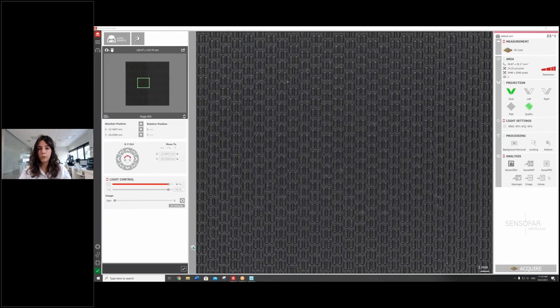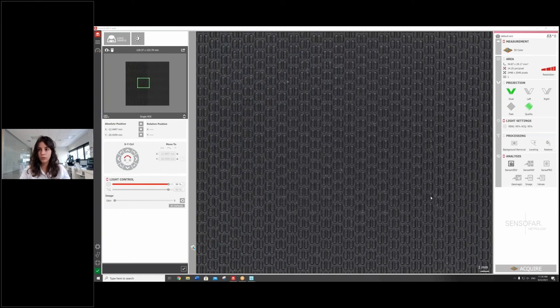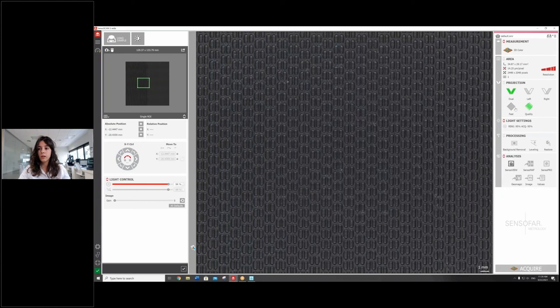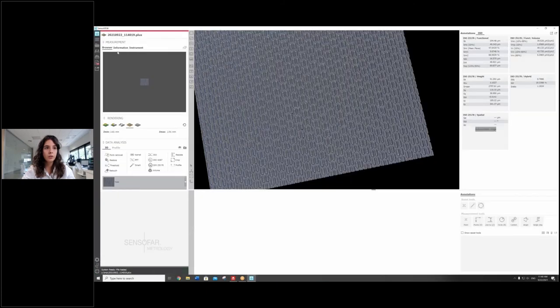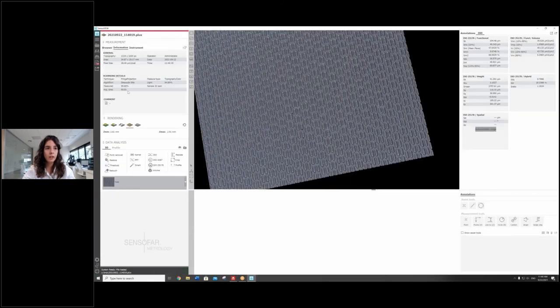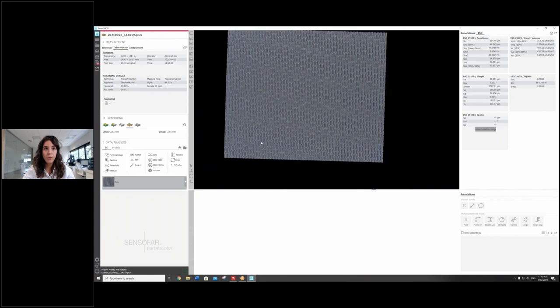But now since we don't have any steep angles, we don't think that this is going to have any risk of occlusion. So we're only going to use one projector and a fast algorithm. So the image is going to be taken faster. And this is the result. It actually took only one second to have this field of view of 33 by 29 millimeters.